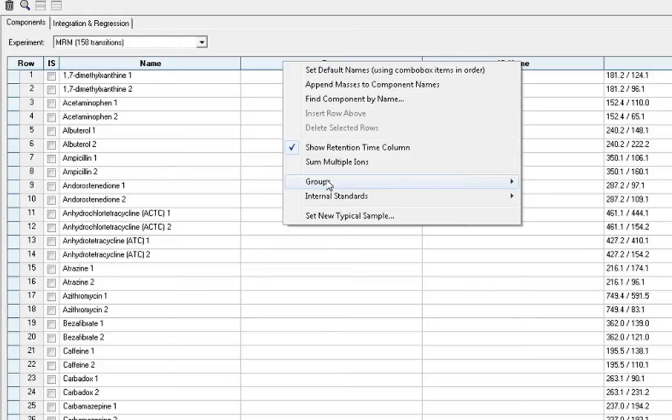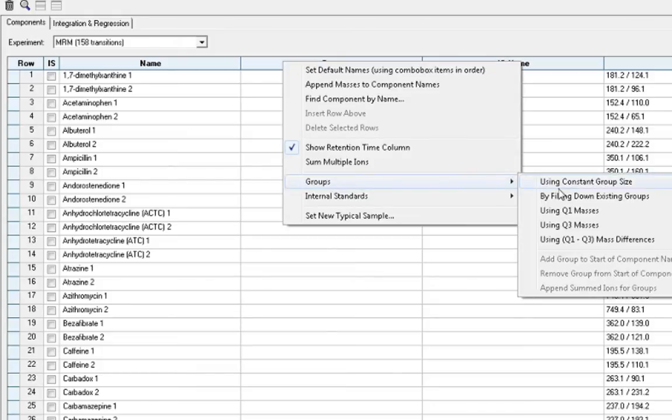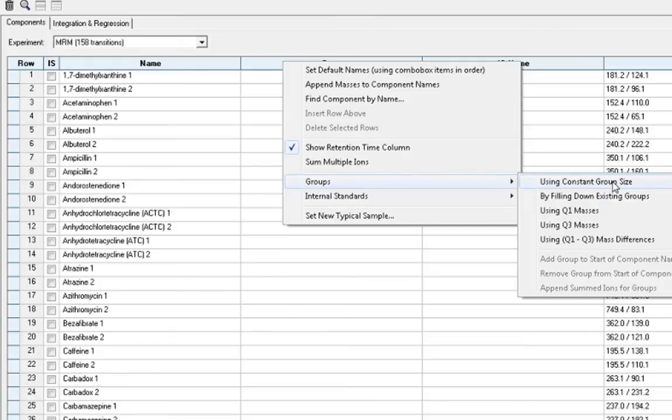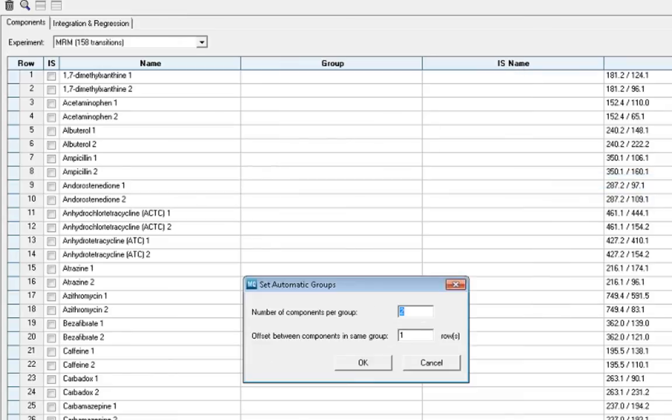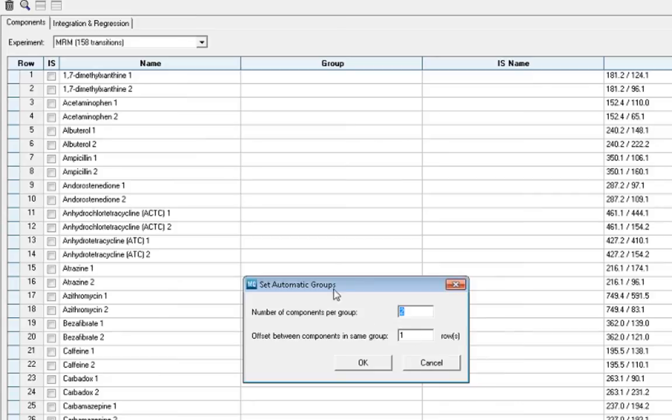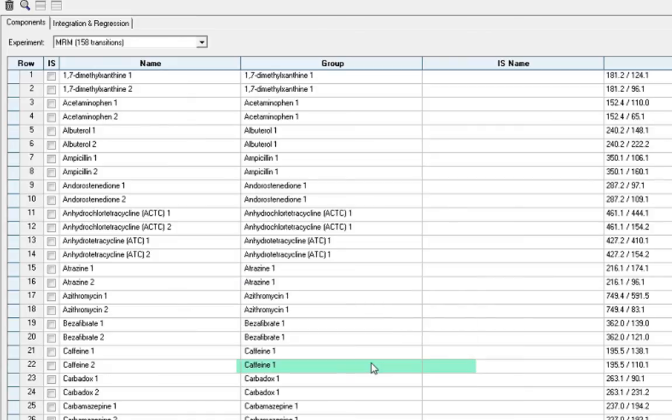To set up these groups, right-click on the group column and select groups. Since we have two MRM transitions per compound and they are listed alphabetically in order, we can select a group using constant group size. We will choose to set up two components per group since we have two MRM transitions for each compound and offset between groups by every one row. MultiQuant then assigns each component to the appropriate group based on the compound name of the first transition.